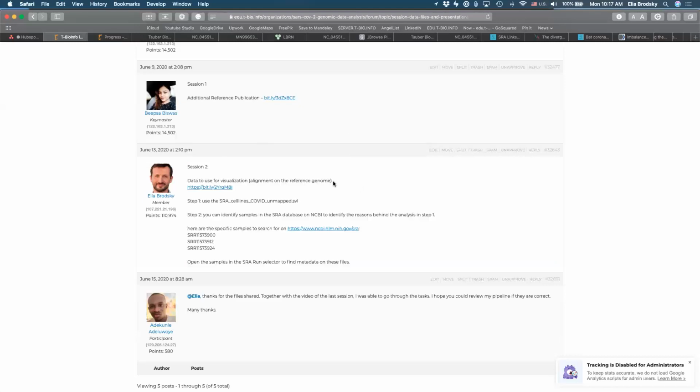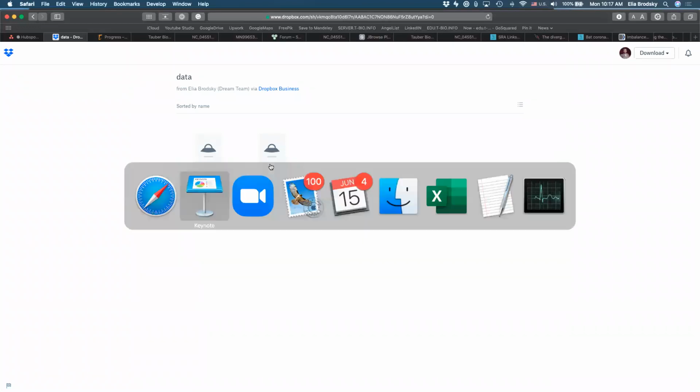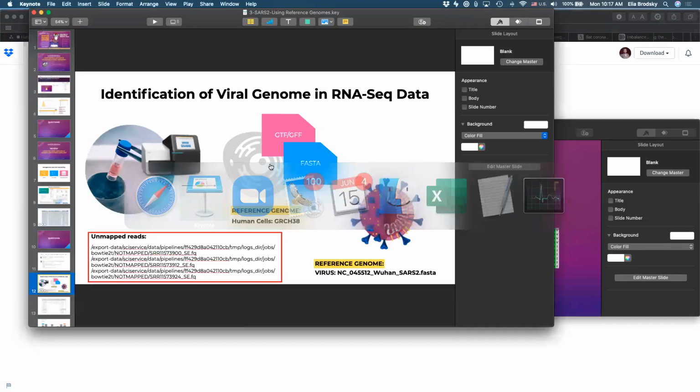So what do we see here? We see here a link, right? This link will open up as a Dropbox link. You'll see here some files, right? And you can just click on download, direct download, save them to your computer, unpack them, and make sure that you have these two files. So that will be important for today's session.